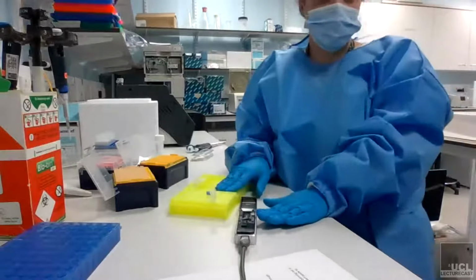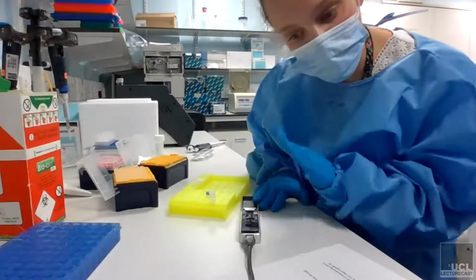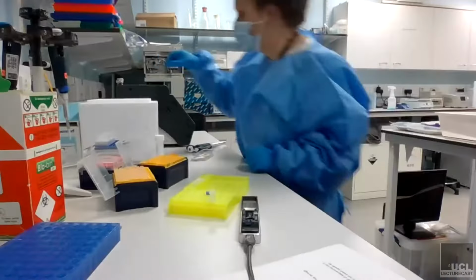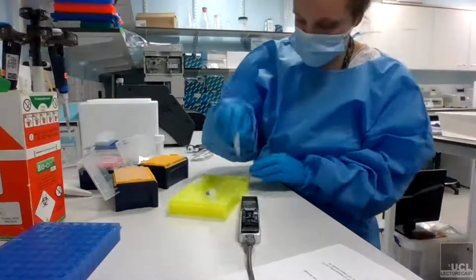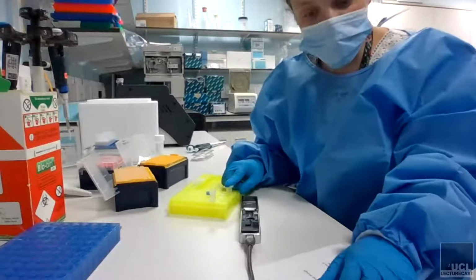So that's the first section of the priming. Once we've done that, we can then start to prepare our sequencing mix. So I'm going to get my pool of DNA back out. And now what we need to do is prepare the library.